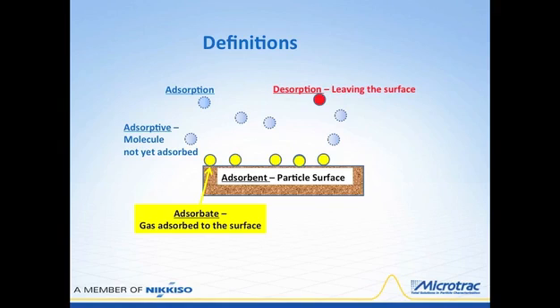Now, another part of the process that we're going to be looking at is the desorption process. And both adsorption and desorption provide for a full isotherm evaluation of the particles in terms of its surface area and some other characteristics and its pore structure.